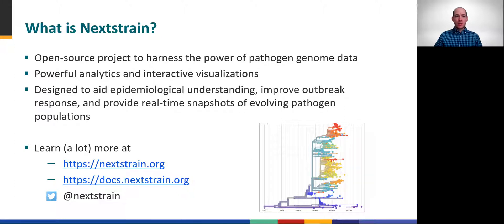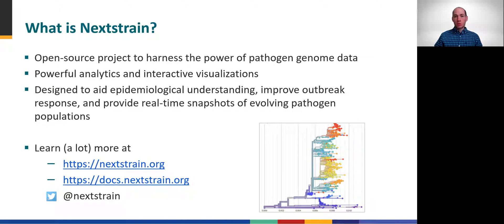We briefly introduced Nextstrain as a powerful tool for interactive visualization of phylogenetic trees, and now we're going to take a closer look. Nextstrain is an open-source collaborative project to harness pathogen genomic sequence data through analytics and interactive visualization. It's become a very popular tool during the present pandemic because it was specifically designed to aid epidemiologic investigations and provide real-time snapshots of evolving pathogen populations.